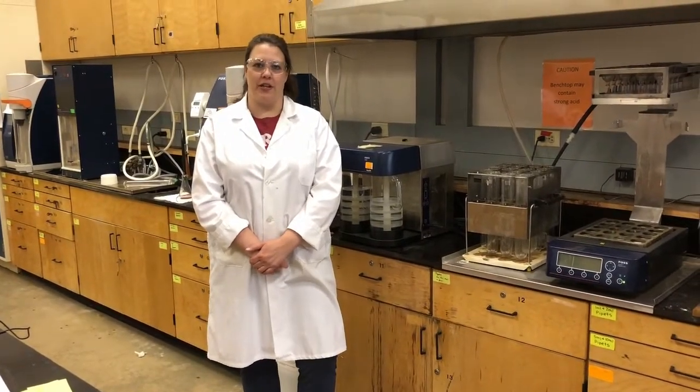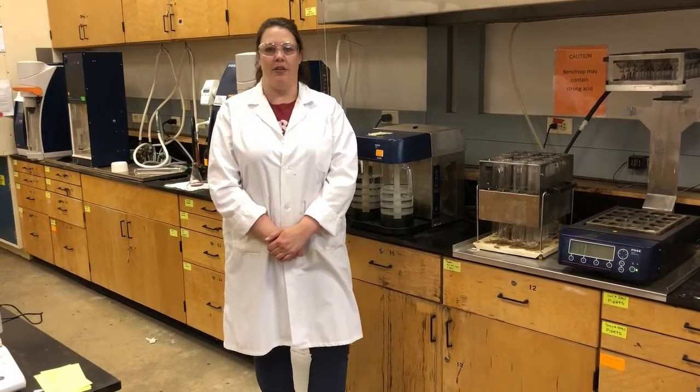So one of the most commonly used methods for determining nitrogen content is a method called the Kjeldahl method. And it was developed in 1883 by a Danish scientist named Kjeldahl, so it was named after him. And even though it was developed in 1883, it's still really widely used today, as it is one of the most reliable methods for determining nitrogen in food, in water, or in any sample really.